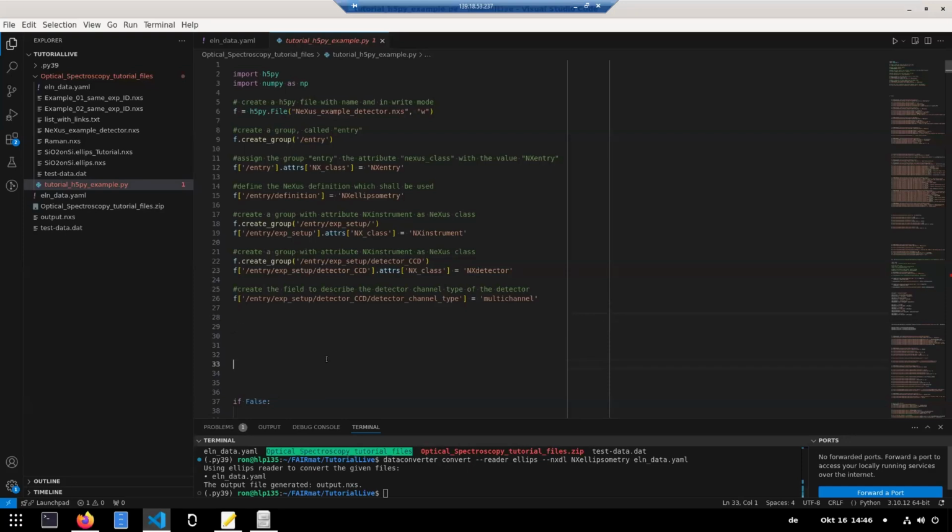This is just you have to manually put in the file names. You can also do it a little bit more advanced, but here, in this example, I just typed in everything hard-coded. For example, if you have now a typo in there, detector with a double T or something like that, you maybe as a human would see that this still most probably references the detector, but the ELN database, which uses the NeXus files input, will not know that this is the detector.